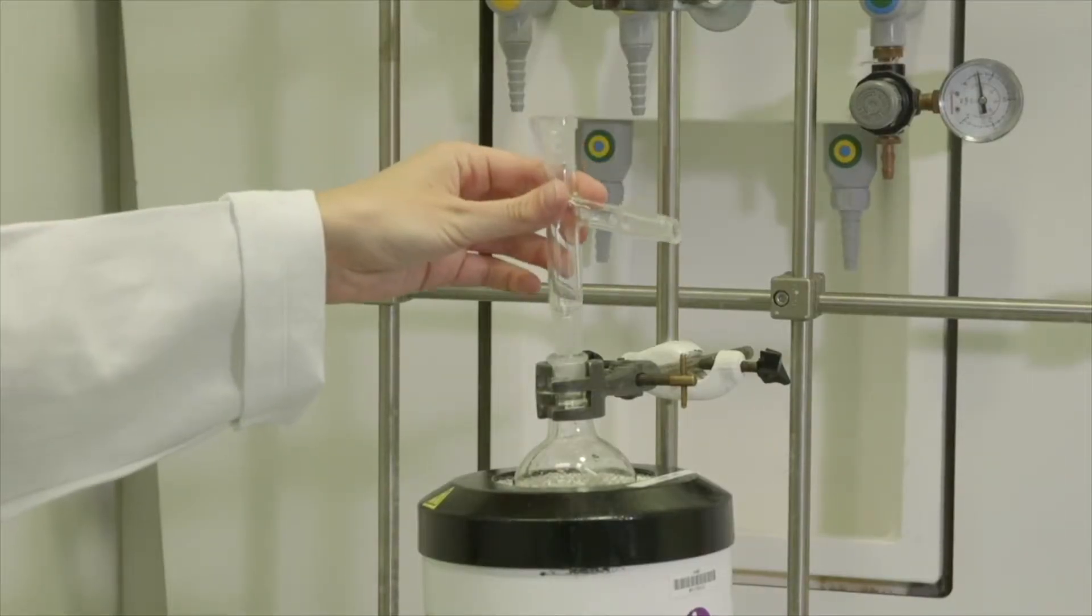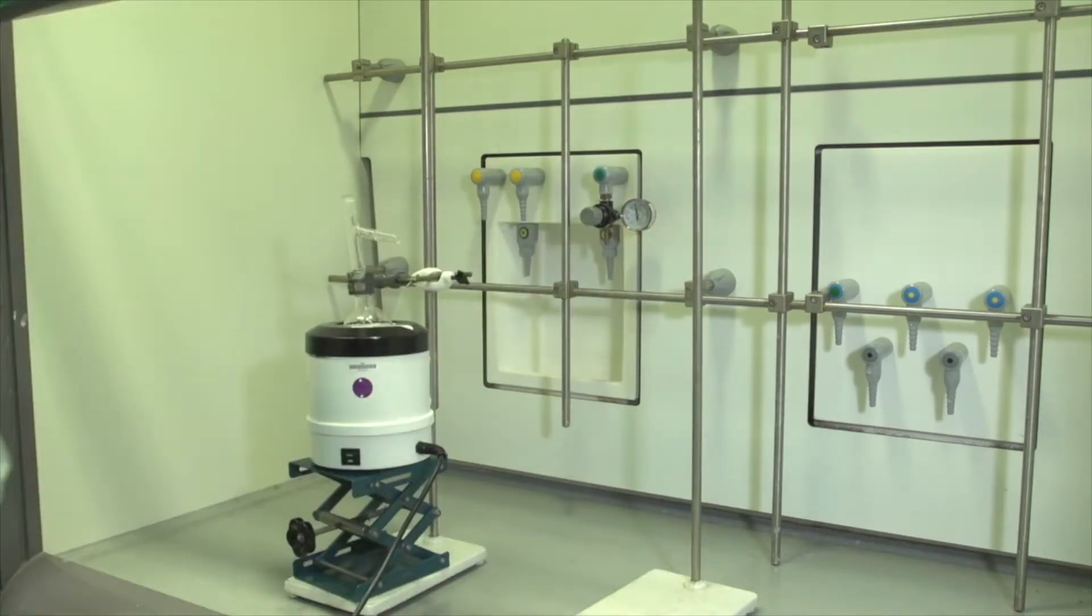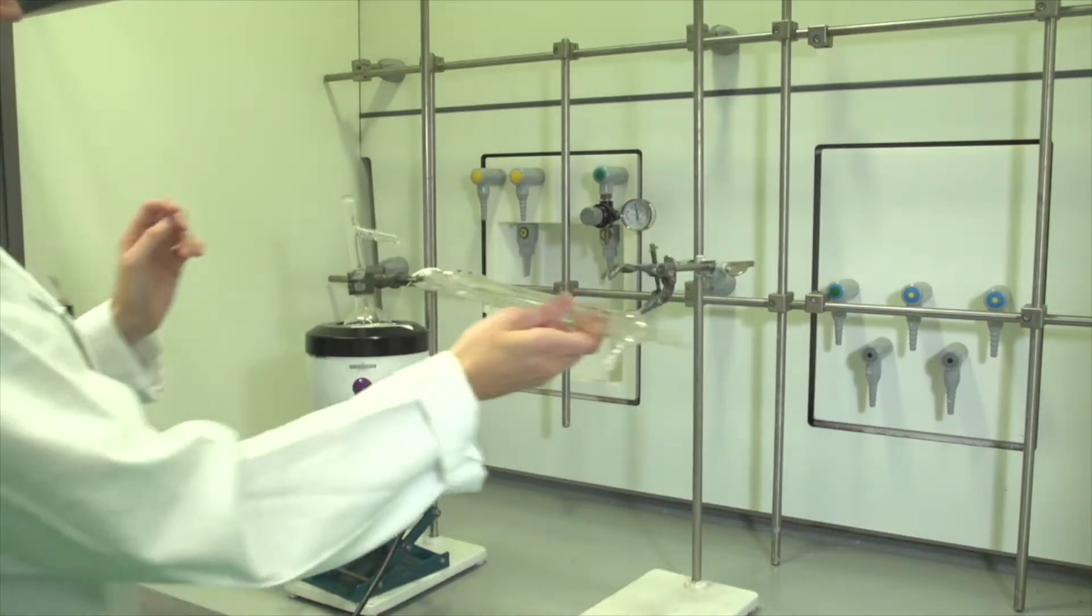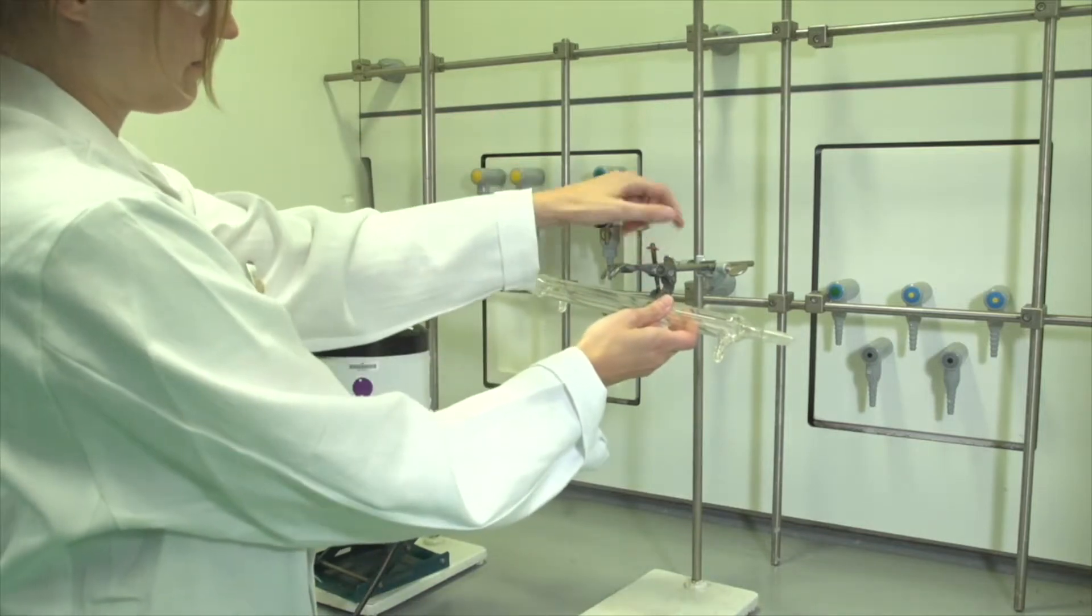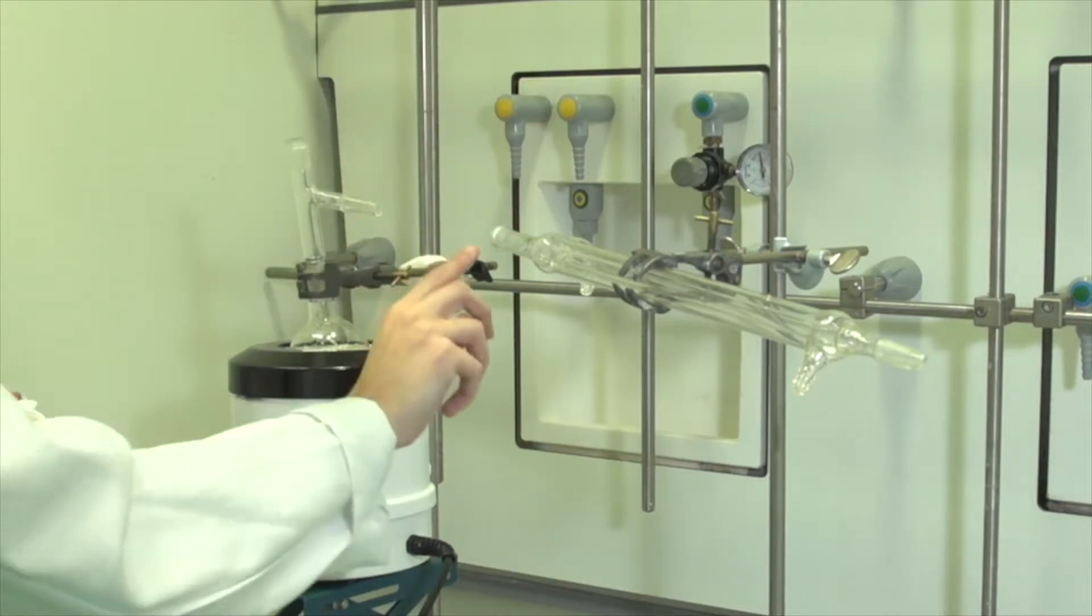Attach the distillation head to the flask. Place the second stand with the clamp attached to it. Fix the Liebig condenser onto the clamp. Grease the ends of the condenser, then attach the condenser to the distillation setup.